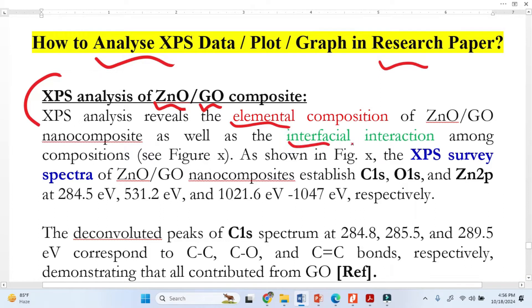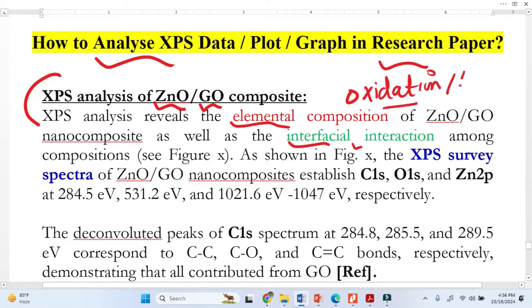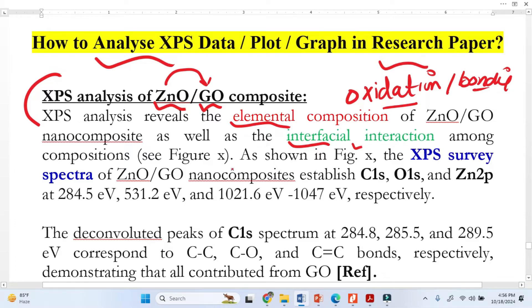From the high-resolution spectra we identify the interfacial interaction — meaning the bonding and the oxidation state. What is the bonding information? This means what is the surrounding environment of that particular element — whether zinc forms a composite with graphene or not, whether they form bonding or not. This kind of information we get from high-resolution spectra.